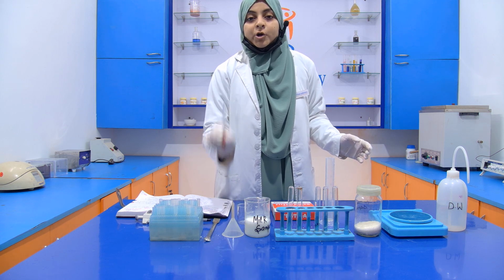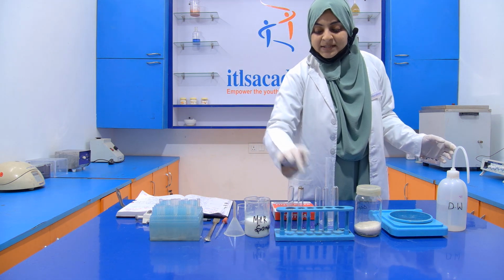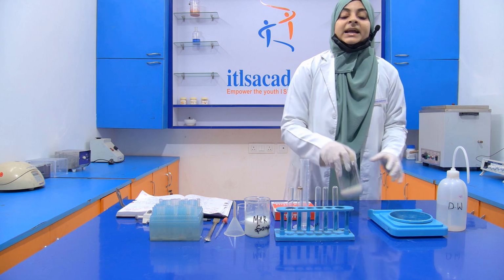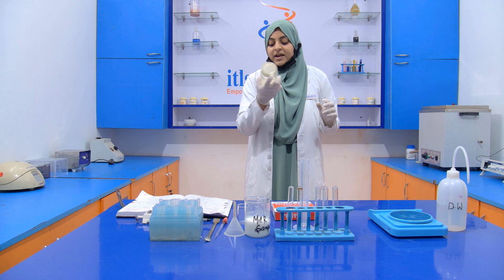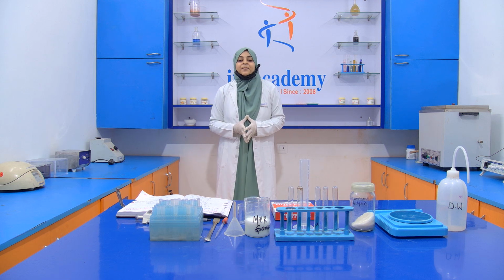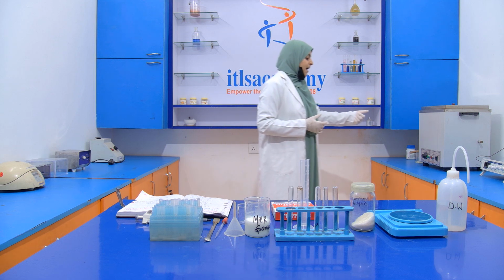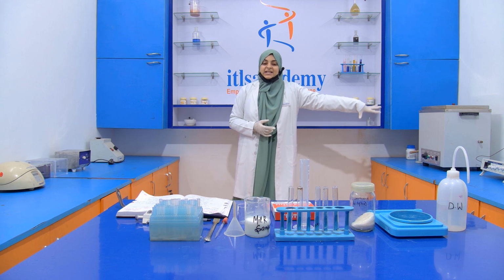Then we require a dropper, funnel, test tube stand, measuring cylinder, weighing balance, and the chemical that we require is ammonium sulfate. This is your ammonium sulfate. One more instrument that we require is a water bath. This is the water bath.